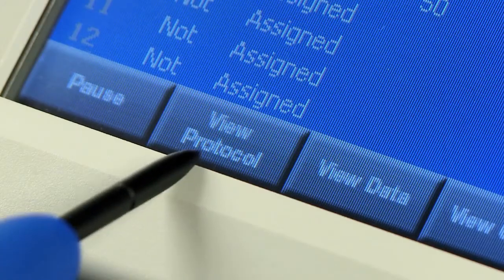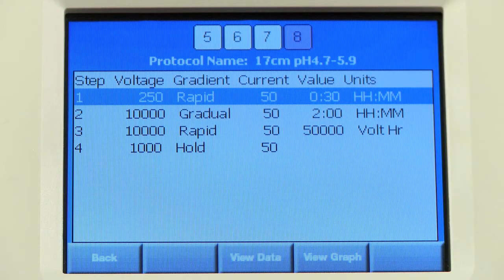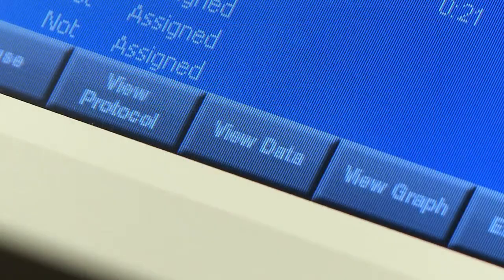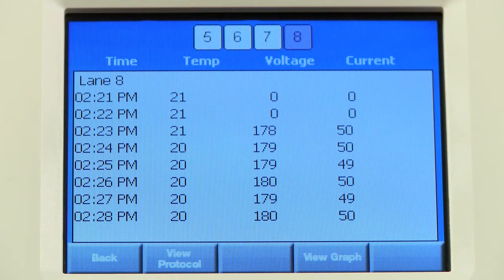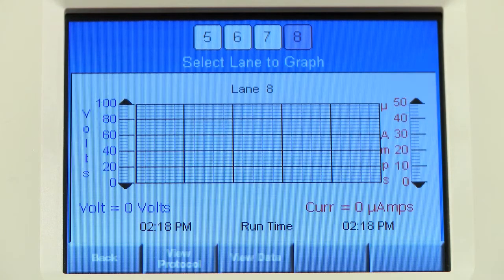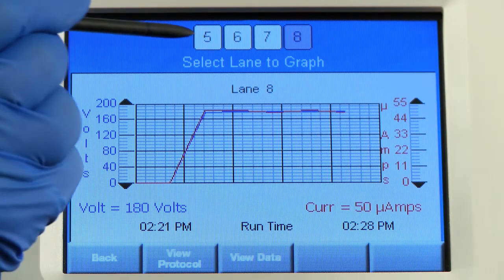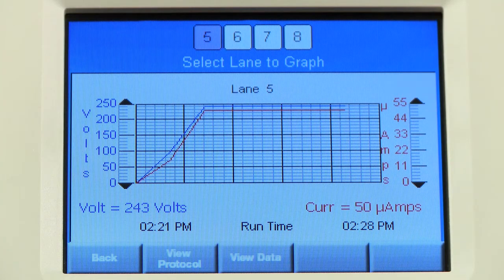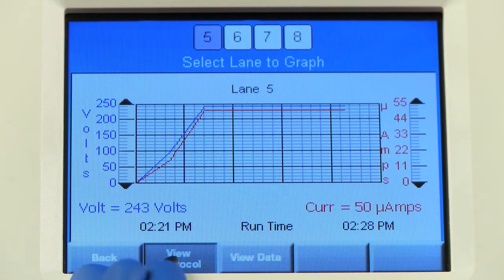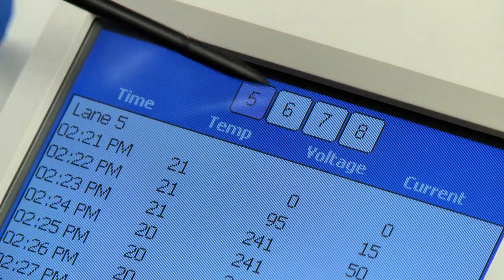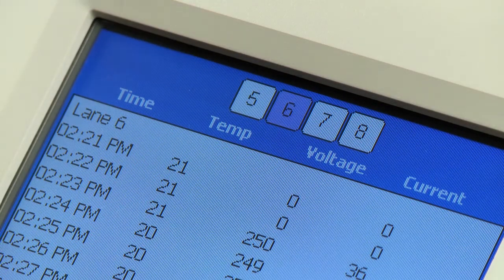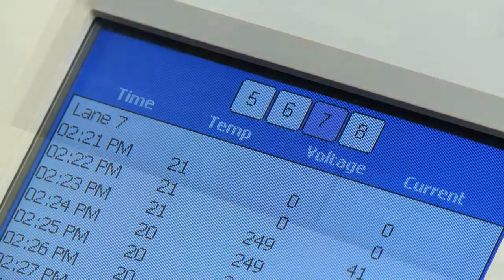Press View Protocol to see the protocol assigned to a specific lane. Press View Data to see the voltage and current data as it is collected. Press View Graph to see a real-time graph of the current and voltage data. The square buttons at the top allow you to toggle between lanes.